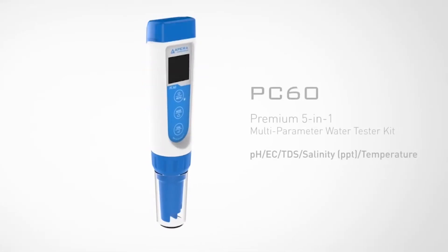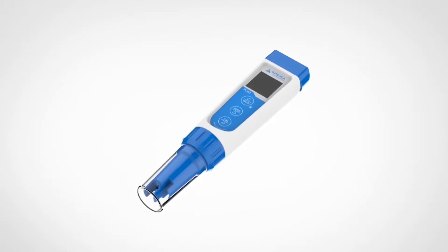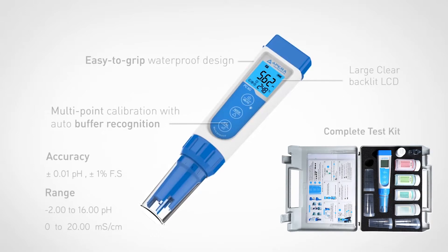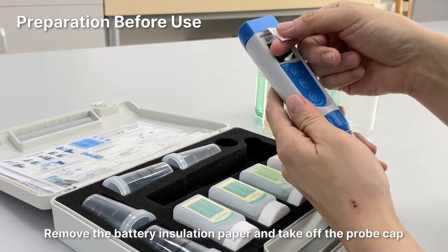Welcome to the video tutorial for the Para Instruments PC60PH Conductivity Multi-Parameter Tester. What's in the kit? Preparation before use.